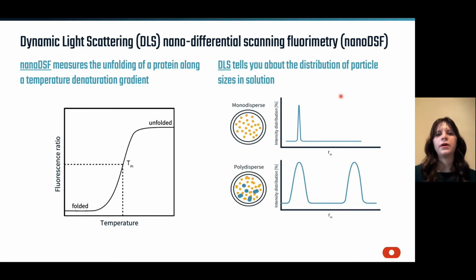Next, we have dynamic light scattering. This is a fairly complicated technique, and I don't want to spend too much time today getting into the weeds of the technical there. But the main take home to realize is the parameters that DLS can give you. And there are two main components. One is the hydrodynamic radius can be determined from DLS. So that's the size of your VLP or AAV or whatever you might be associating, as well as the dispersity. So if there are higher order oligomers, or if the association of your vector is not very good, then you might see this peak broadening. And that is indicated by a PDI or polydispersity index value.